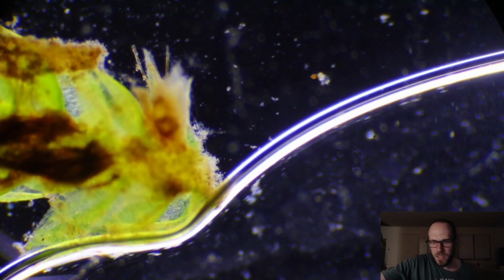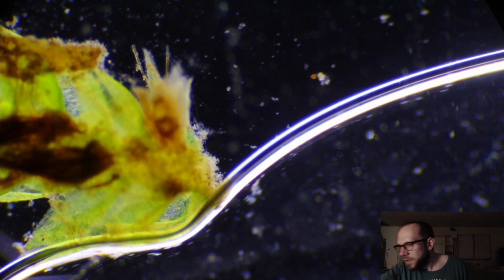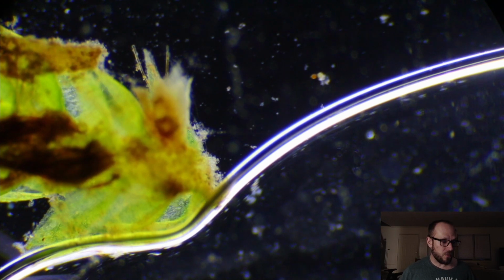Let's switch slides again. I don't know that this was the one I thought it was. It's still a very good slide, but it's not the one. This slide was cool because it had those fat parameciums on it, which I adore because you could just see these large globes of matter inside them. I kind of wish they didn't move so quickly, but at the same time, they're cool.